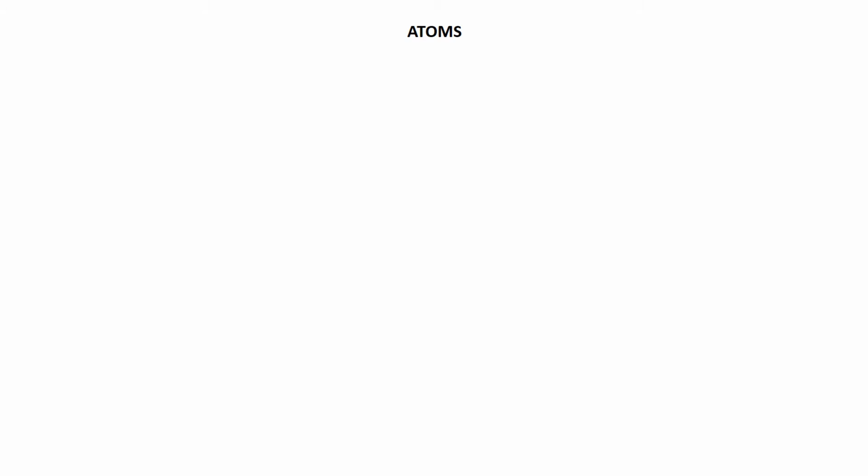So the first place that one could mention mass spectrometry in a chemistry course is when one is talking about isotopes. Isotopes are, of course, two atoms that are identical in terms of their important bit, their charge on the nucleus, the number of electrons, their fundamental chemistry, but they differ in terms of mass because they have different numbers of neutrons. And because they're identical, it's very hard to tell them apart until you can start to distinguish the atoms in terms of their mass, which is where mass spectrometry comes in.